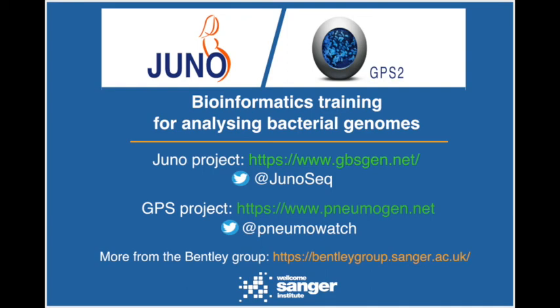Question number 6. How do we construct a Newick tree? We were discussing how to answer this question, and we can have a very long answer, which would be a separate webinar, or a very short one, and we decided to go with the short one: we can use a number of different tools and software. We're going to use IQ-Tree in training, which is becoming very popular because it's got lots of options and does a lot of the hard work for the user. It actually selects the best model for you.